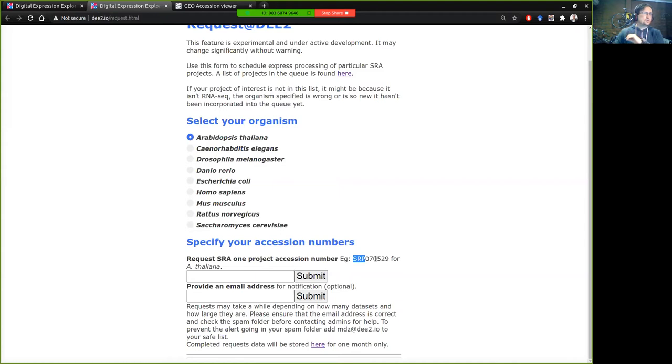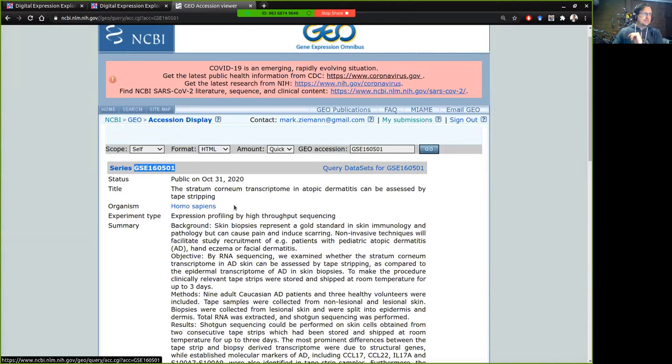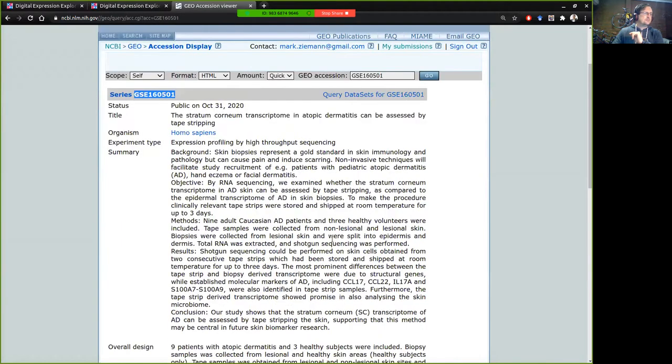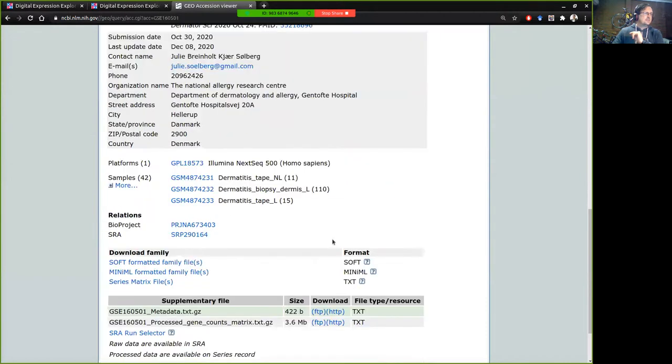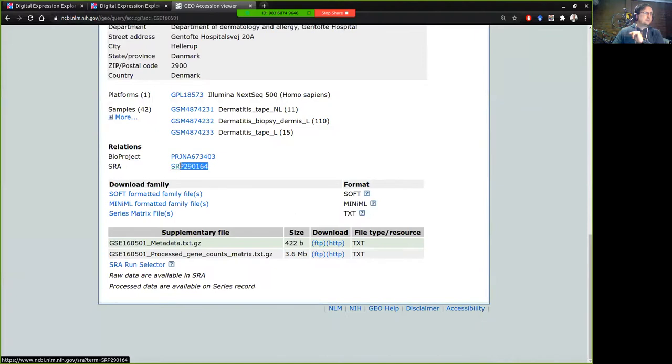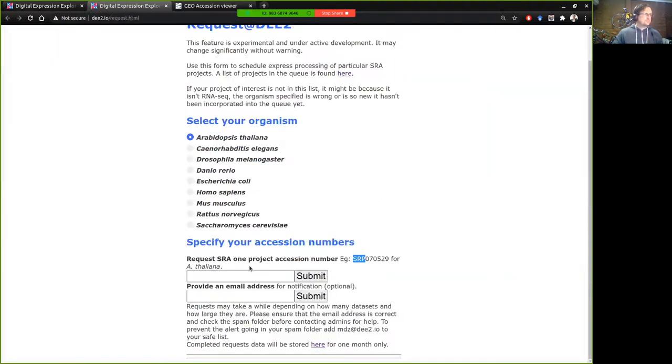So for example if in a paper you're given a GeoSeries number that starts with GSE then you'll need to navigate to NCBI GEO and scroll down a little bit to find the SRP number. So that's this one here and once you've got that number you can just try it in that box there.